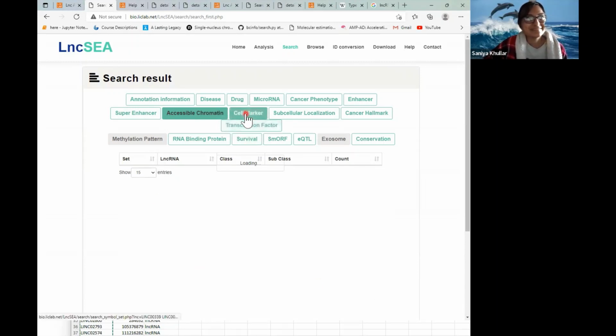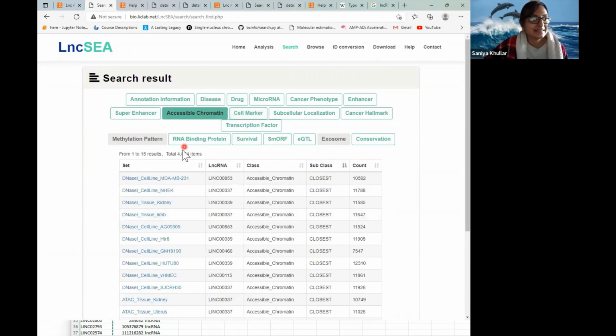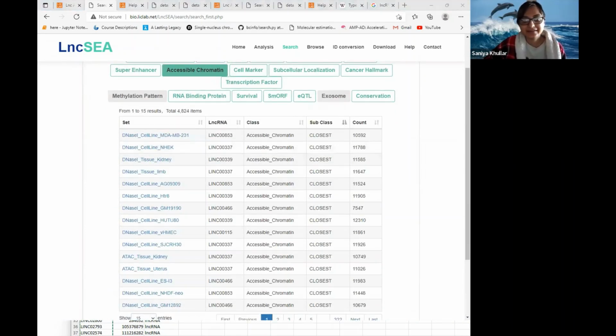It's taking a little bit of time. Yeah, and this is like DNase as well.